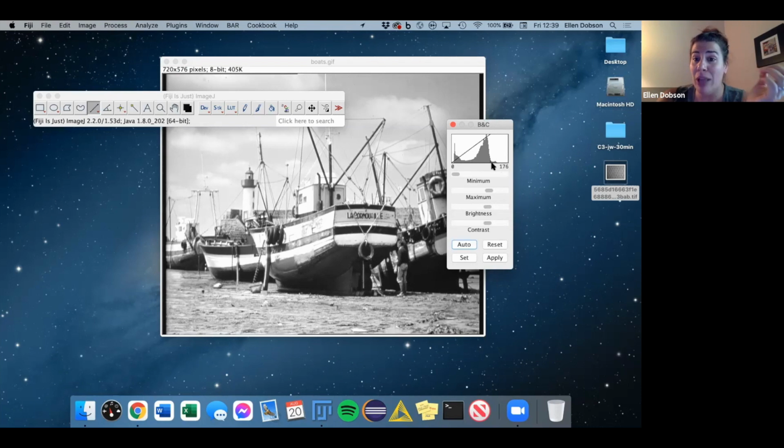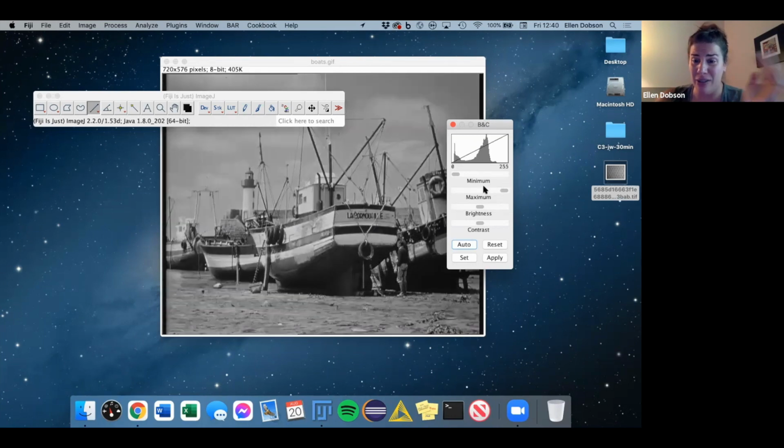That will actually change the pixels that are displayed and then clip off your data. So you never want to click apply, because that will rewrite over your pixels. But everything else on here, this auto, all it's doing is just adjusting visualization.